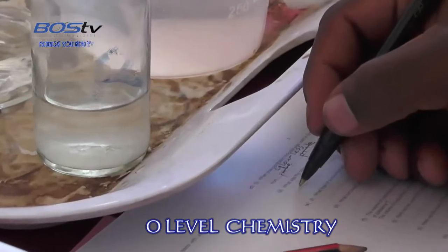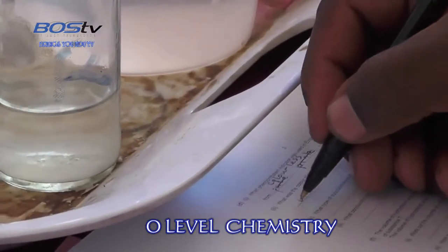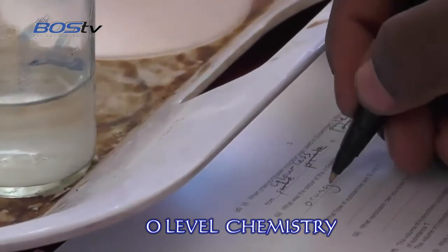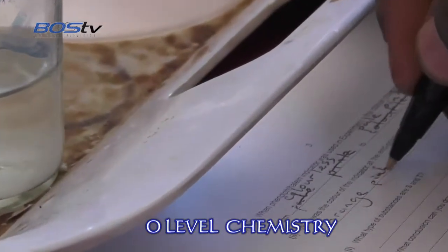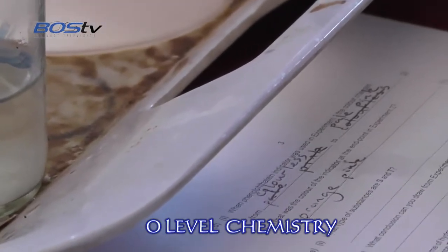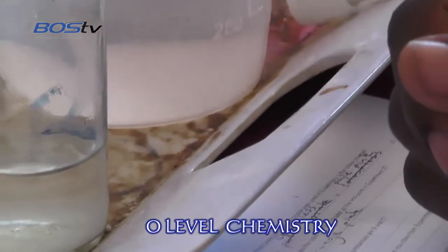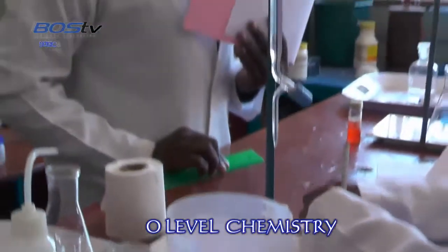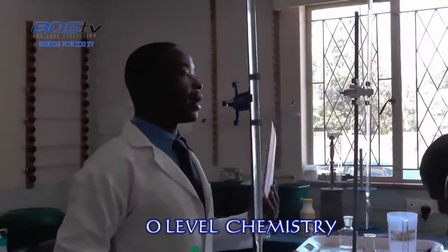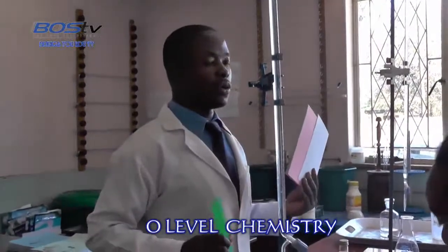Okay, what type of substances are S and T? They've reacted with an acid and they're soluble. Bases is not the acceptable answer, though it's sort of correct. A soluble base is called what? An alkali. So alkali is the correct answer.